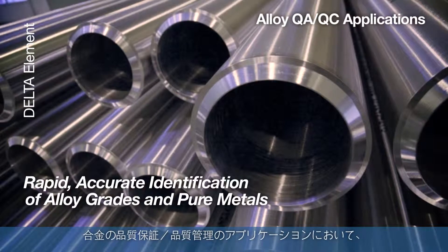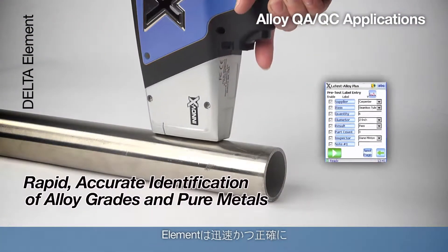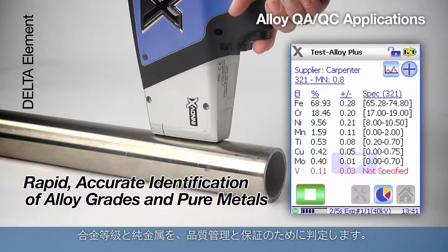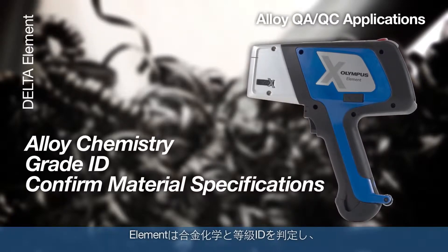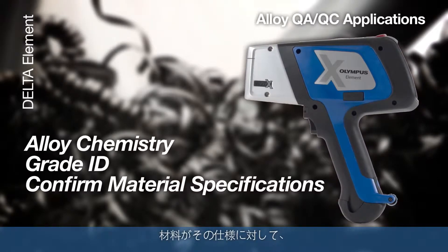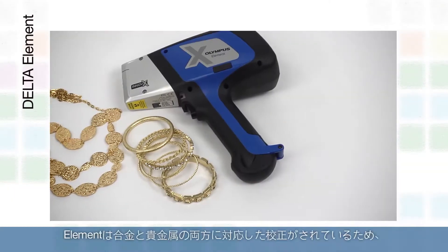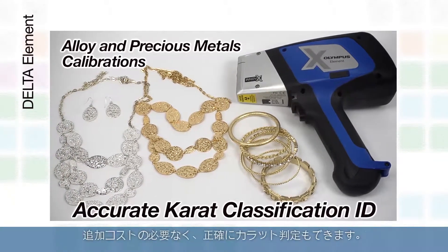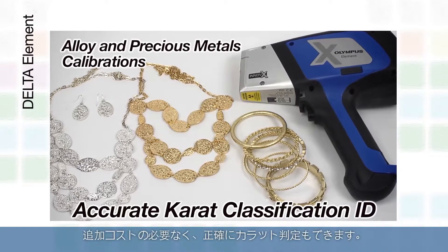For alloy QAQC applications, the Element rapidly and accurately identifies alloy grades and pure metals for quality control and assurance. The Element determines alloy chemistry and grade ID to confirm material specification from the manufacturer to the end user, and comes equipped with both alloy and precious metals calibrations for identifying accurate carat classification at no extra cost.